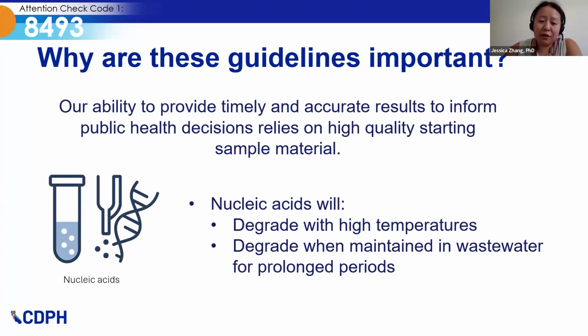And as Brady mentioned earlier, we perform droplet digital PCR on our samples, which relies on using the nucleic acids found within the samples to provide estimates of viral concentrations across the state. These nucleic acids within the samples are more likely to degrade with higher temperatures, and potentially degrade more if they're maintained in wastewater, since we don't know how good of a preservative wastewater is for nucleic acids.